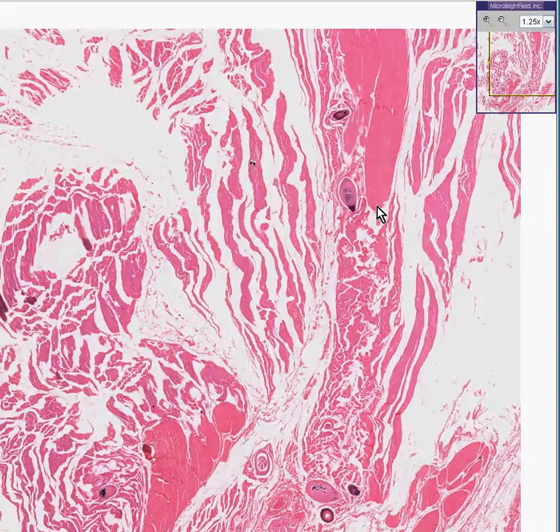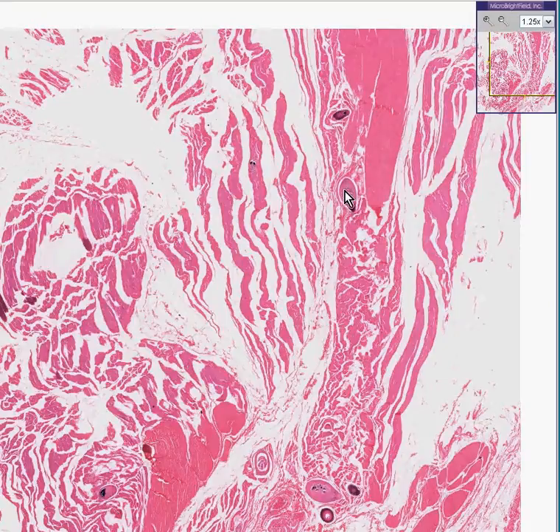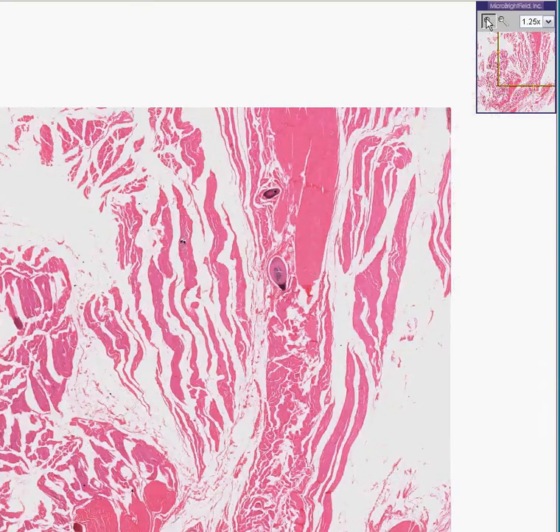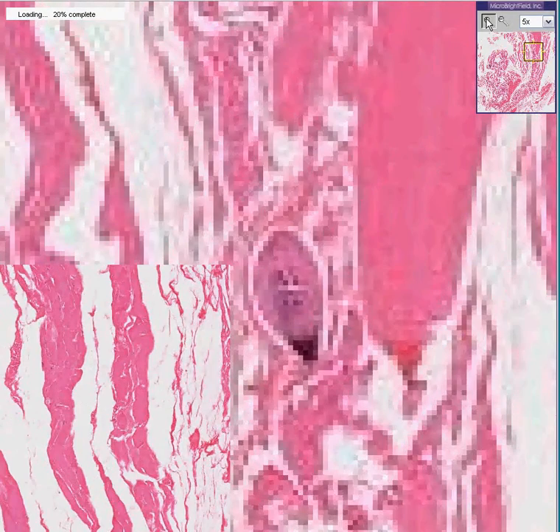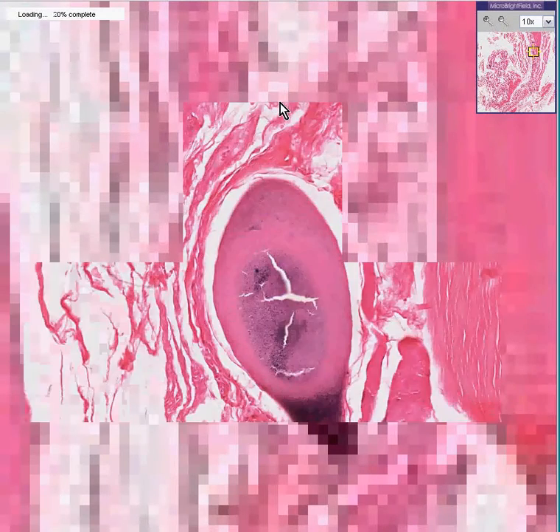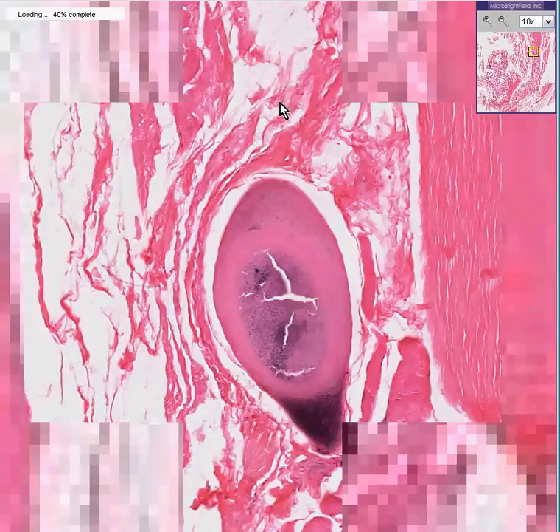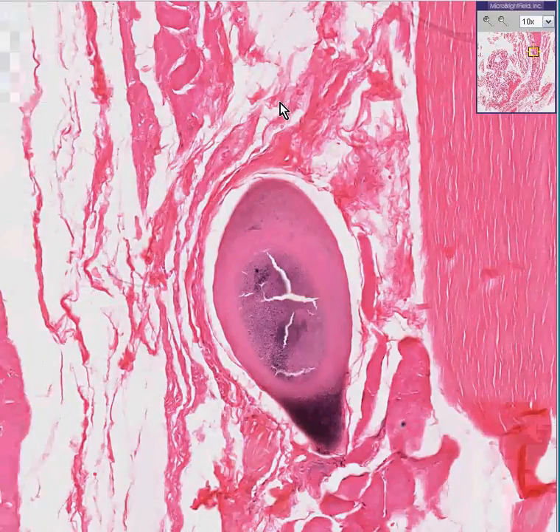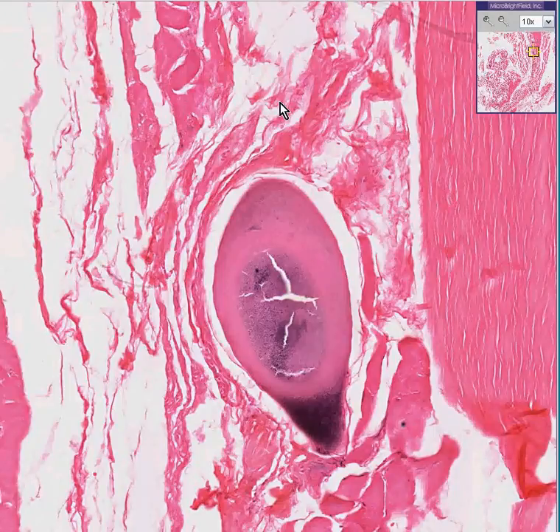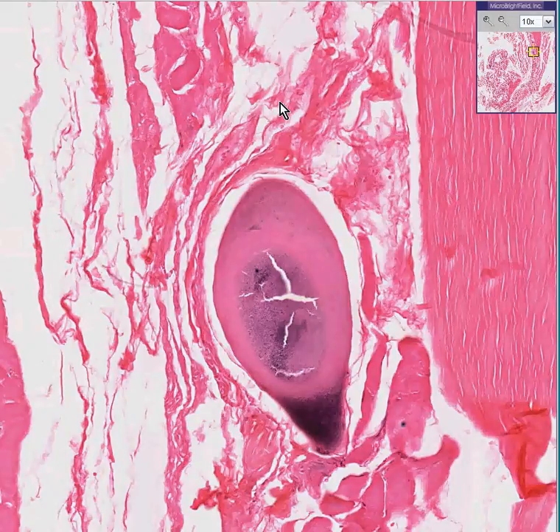They have that same staining, and they look very distinct and very oval, with various sizes and slightly different shapes. And if the first thing you think of when you look at this is that it really doesn't look like any human type of tissue you've ever seen — you're right. This is not human tissue. This is the larva of the roundworm Trichinella spiralis, the parasite you get from eating inadequately cooked pork.